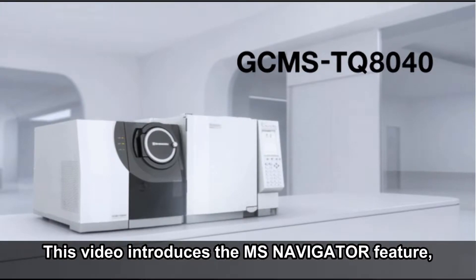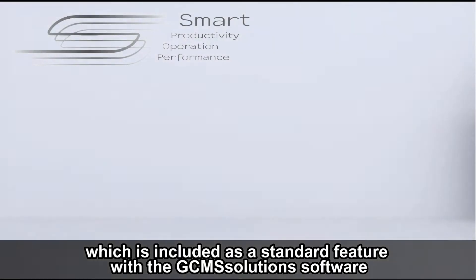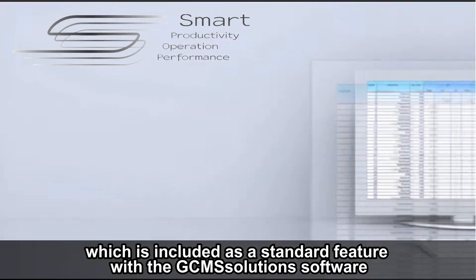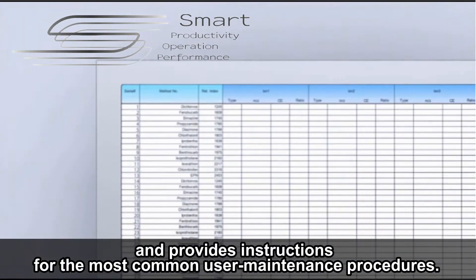This video introduces the MS Navigator feature, which is included as a standard feature with the GC-MS Solutions software and provides instructions for the most common user maintenance procedures.